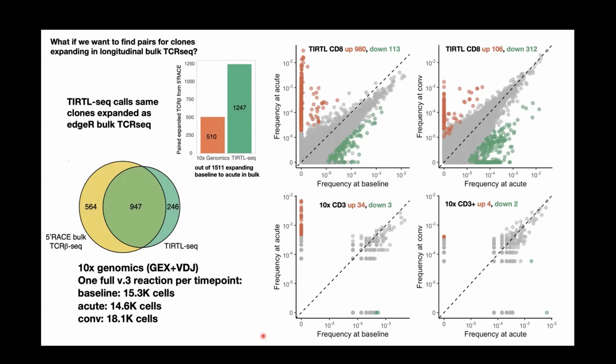Yeah. But the thing is that sequencing short is cheap and high performant, right? So we do 2 times 150 because this is what's most economical. But I mean, it improves with time, right? So just moving the primers left, it's a bit of an issue, but it's not impossible.